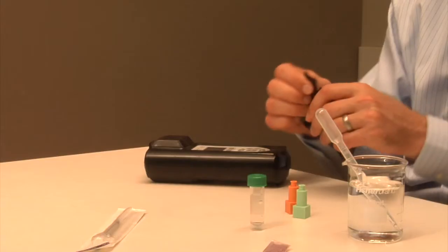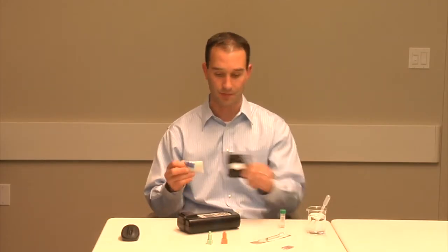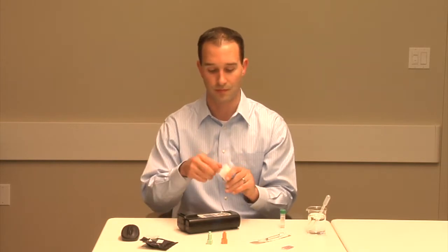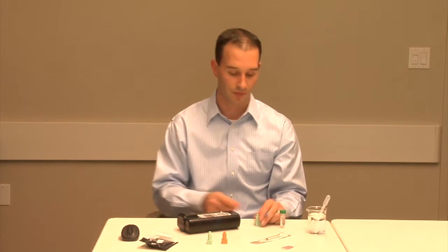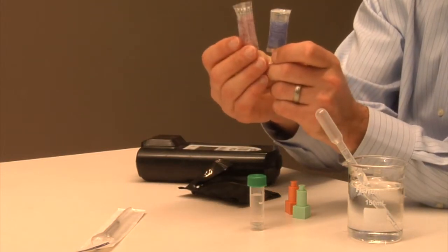Now, let's open the sensor bag, which contains the colored sensor, a plastic cuvette, and a desiccant. The desiccant should be blue in color. If it is turned pink, the sensor may not perform well. Place the plastic cuvette in the instrument.